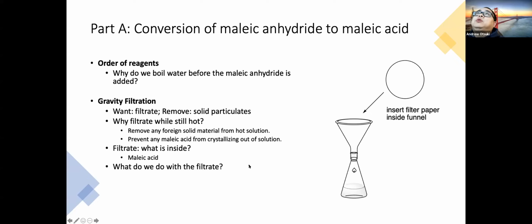So what do we do with the filtrate? Do we throw it away or do we keep it? Someone hazard a guess. Do we keep it or do we leave it? Or let me ask you, is this the end of the experiment? Well, hopefully everyone says no. Yes, thank you. Keep it, right? We're going to keep it because we're not done with the experiment.